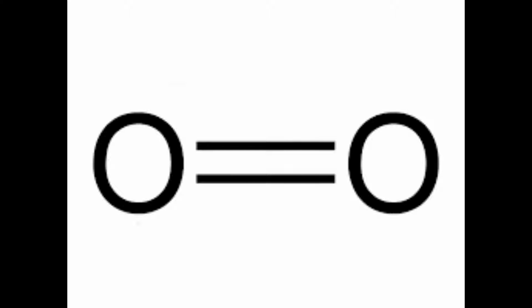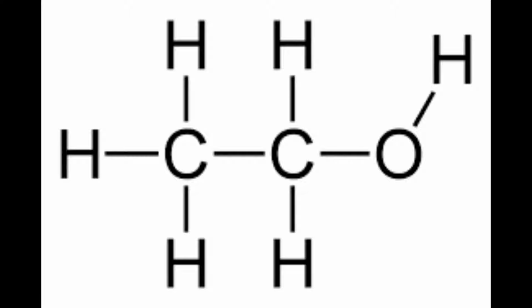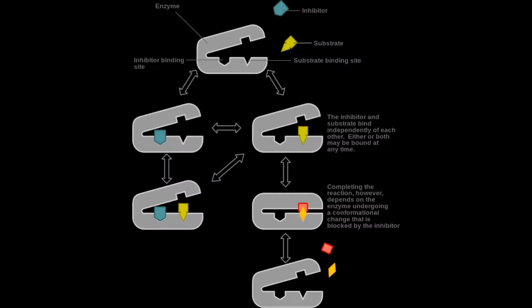For the most part, the results collected from the experiment do match the hypothesis. Ethanol slows down the reaction because it is a non-competitive inhibitor. This means that it binds to and changes the shape of catalase, ultimately reducing its activity. Also, when high concentration ethanol is added to the reaction, it denatures catalase.